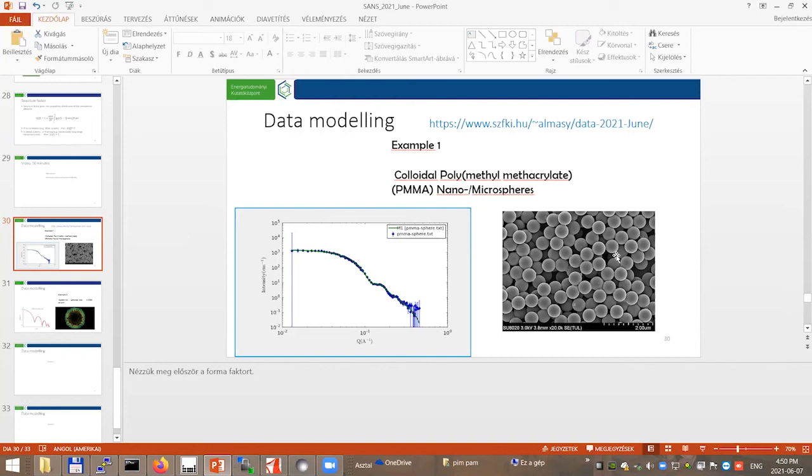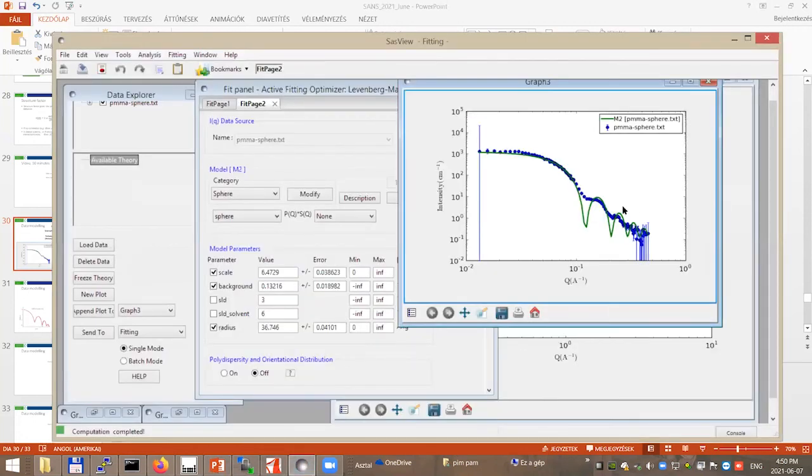Yeah, exactly. So this is one possibility, that these spheres stick to each other, at least a few of them, and make clusters. Then they will surely distort the scattering picture. But the fact is, if there is a cluster, then it can be regarded as a bigger object. And the bigger object will have a scattering which comes somewhere here. So the scattering intensity will be bigger at the small angles. So it means that the main factor of the discrepancy is not the clustering.